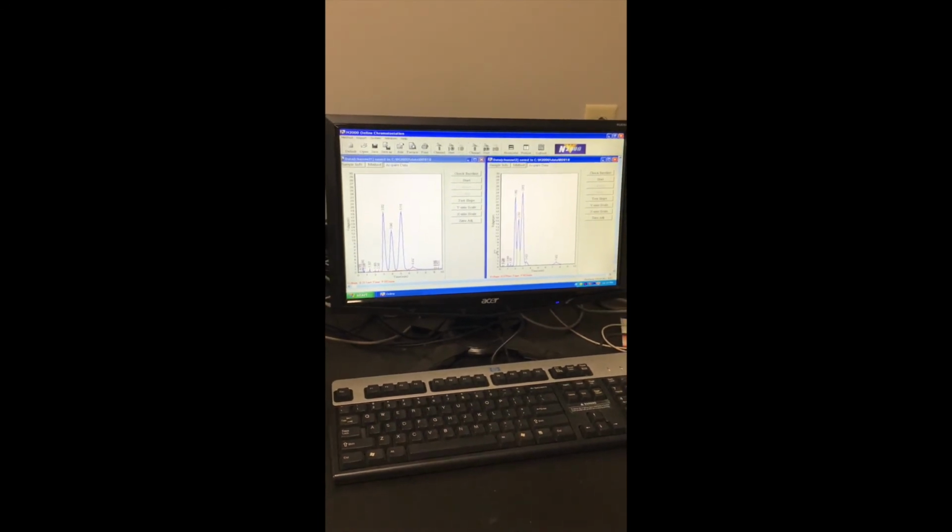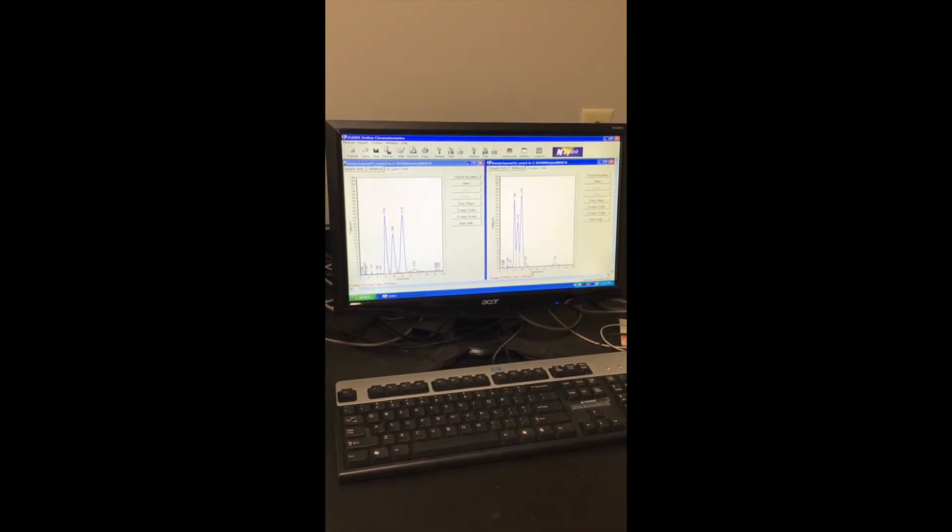Often it will be simpler if you have one particular product going through the GC, but it's going to look something like this. You have time on the x-axis and voltage on the y-axis, and then based on the stuff that's coming through, you will get some kind of record that comes in and produces on here.